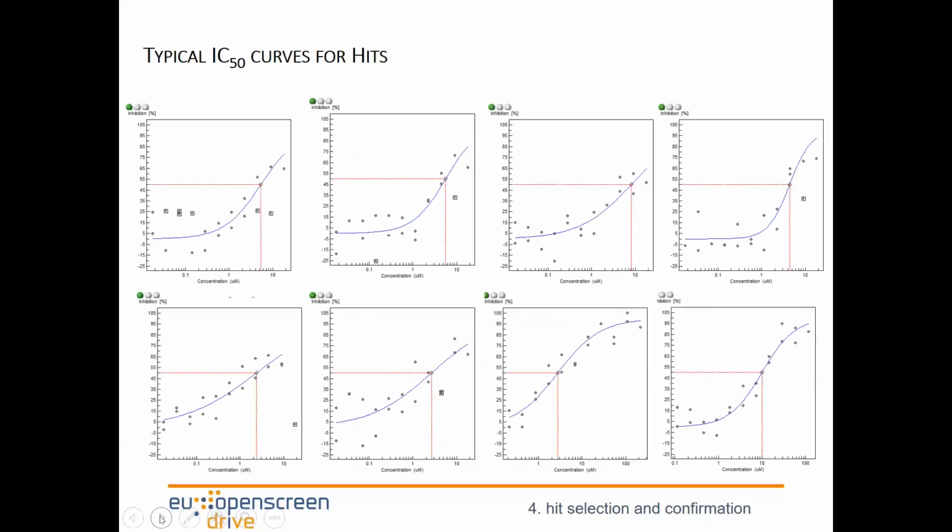And then you would run a secondary assay just to check that the compounds are active in a secondary screen. And then you will do dose response studies at a range of concentrations and determine the absolute potency of the compounds. We know theoretically dose response curves should be nice and sigmoid. They should have a nice slope factor of 1. You should have a minimum and a maximum of between 0 and 100%.